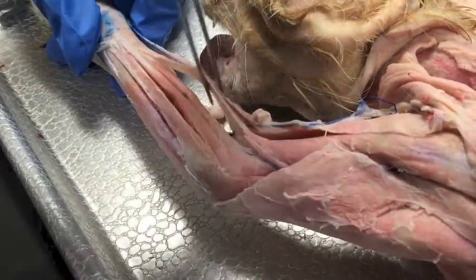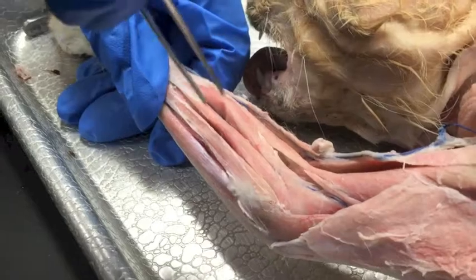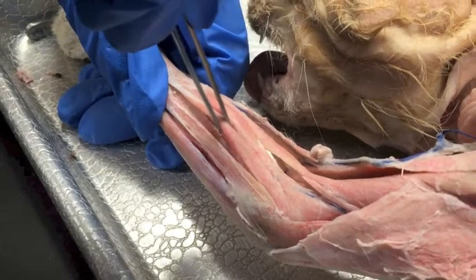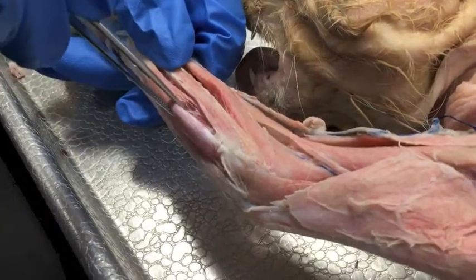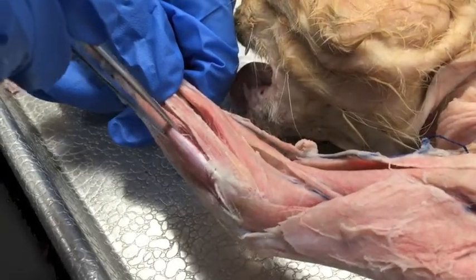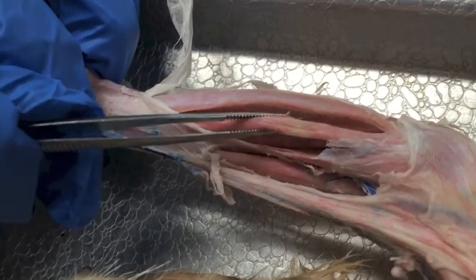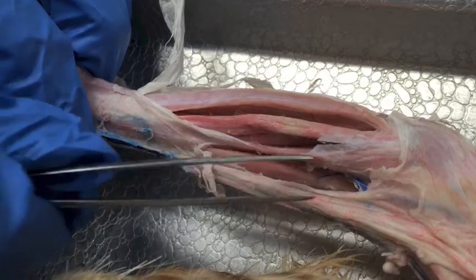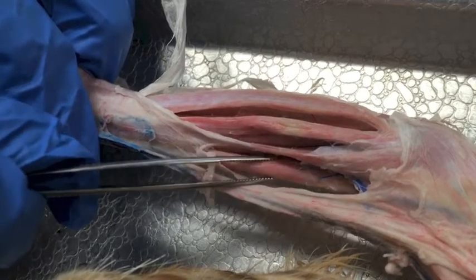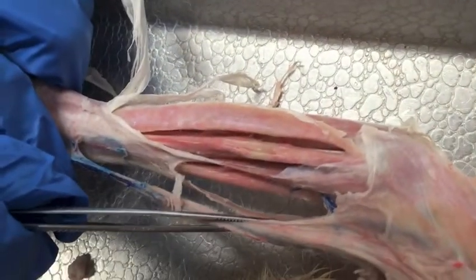The brachioradialis, the extensor carpi radialis, the extensor digitorum communis, the extensor digitorum lateralis, and the extensor carpi ulnaris. Then the palmaris longus, the flexor carpi radialis, the pronator teres, then we have the extensor carpi radialis and the brachioradialis.